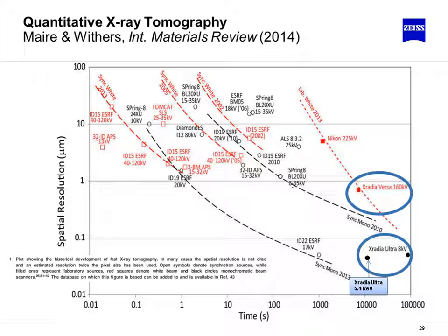From a battery perspective, we're interested in timescales that span from milliseconds, which are associated with the catastrophic failure, the explosions that we saw in that thermal video right at the beginning, through to many thousands of hours. If you buy a lithium-ion battery-powered car, you would probably expect a warranty of about 7 years. And so there are more than 10 orders of magnitude in terms of the time scales that we need to probe, as well as many orders of magnitude in the length scales that we need to probe, and I've highlighted that already.